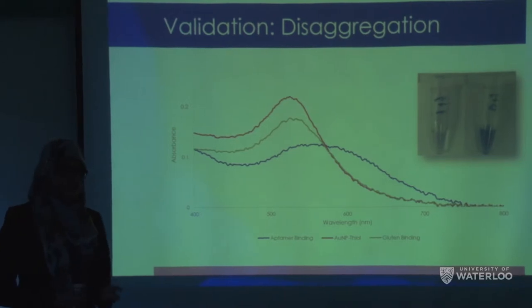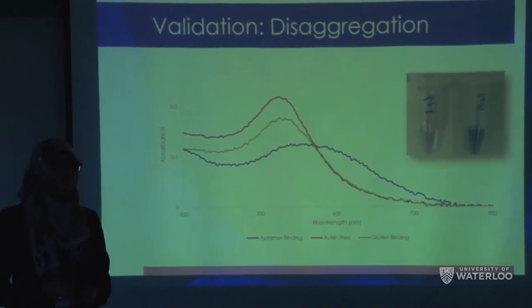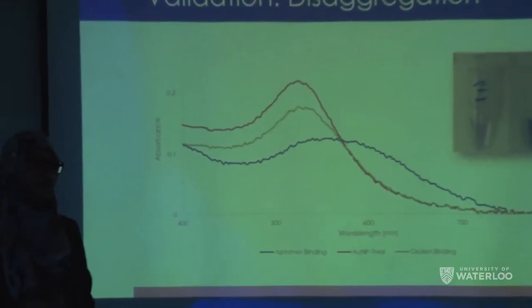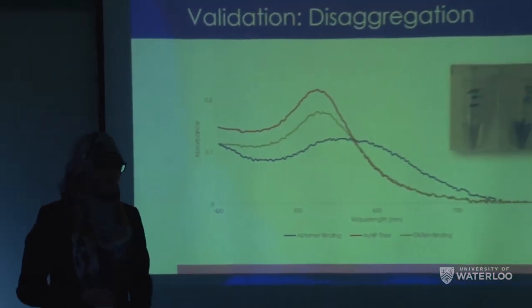In terms of disaggregation, we wanted to see that with the addition of gluten, we'd be able to find an actual change in color. And we also wanted to see if the peaks would shift back. And we were able to see that. We did gluten at 20 ppm. This, of course, is a concentration which triggers a reaction in celiacs. And the green spectra is the gluten. And you can see it goes back to almost the same as the gold nanoparticle spectra, with almost full recovery of the sample. This shows, again, that our sample was able to redisperse properly, and we were able to see the color change, as you can see in the picture on the top.